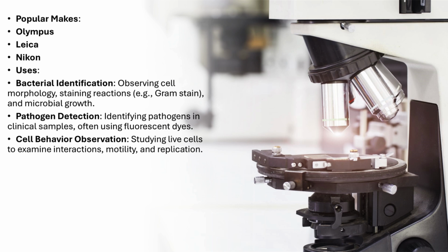Cell behavior observation. Microscopes also allow us to study live cells in action. We can observe their movement, replication, and how they interact with other cells or substances in their environment.